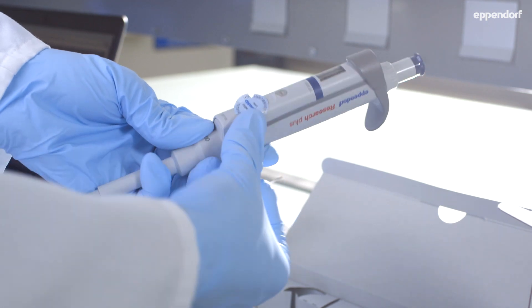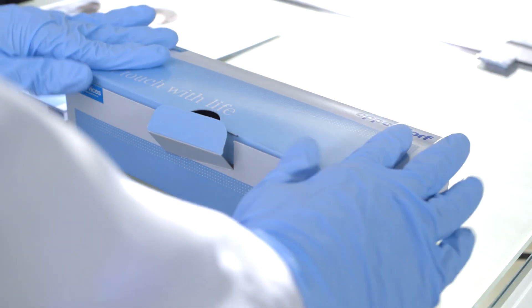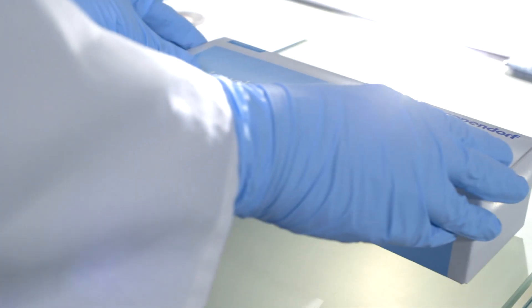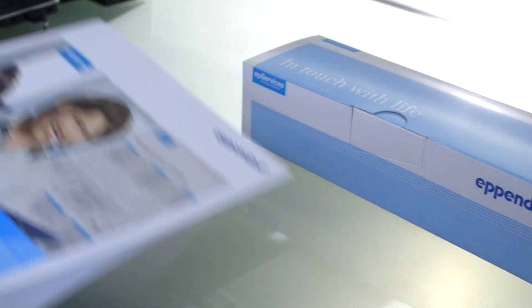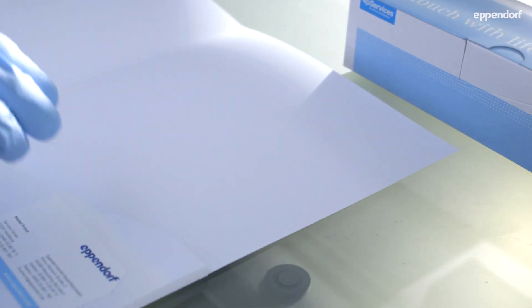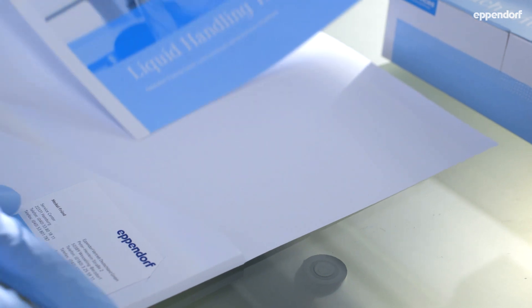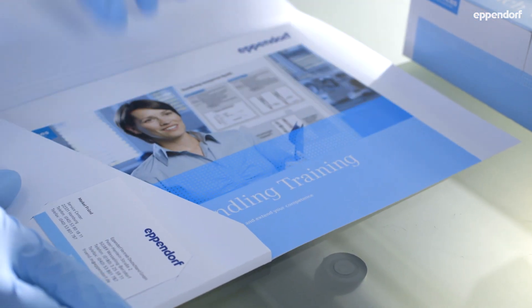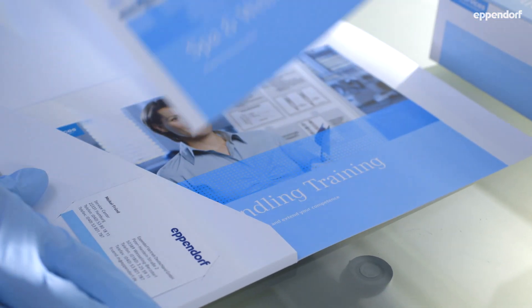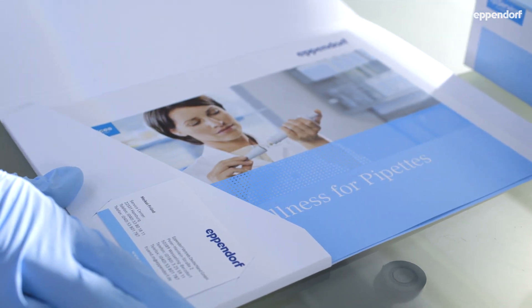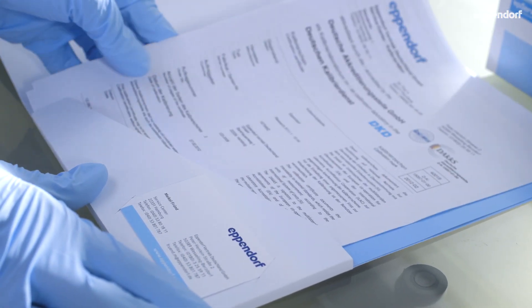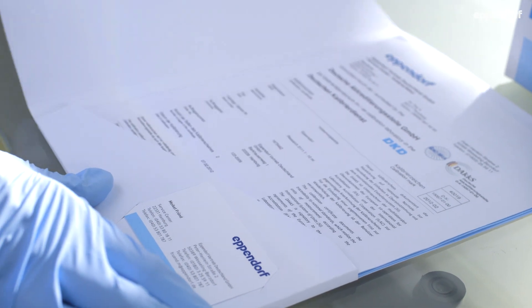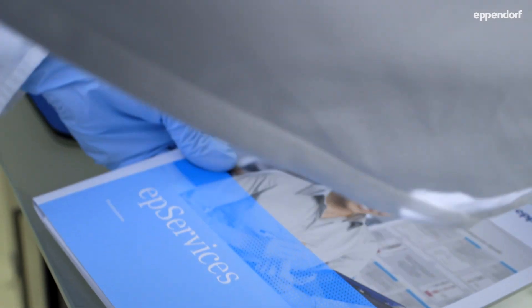A sticker with the date of the next service is attached to your pipette. Eppendorf provides seminars and workshops that allow you to develop more advanced skills for calibration and pipetting techniques. Calibration reports are provided for your documentation needs. Our certified reports are designed to support your internal and external audits.